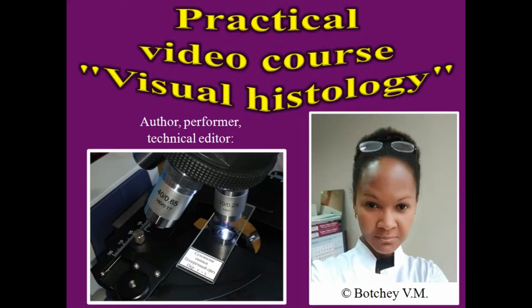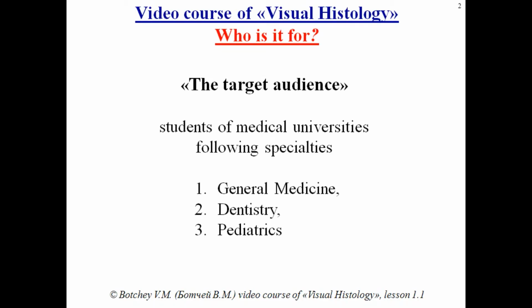In this course, we will analyze the histological slides, which we will study in practice class, and of course you will meet at the final histology exam. The content of the video course corresponds to the Medical University program for students following specialties: general medicine, dentistry, and pediatrics. The course structure corresponds to the plan of our department.